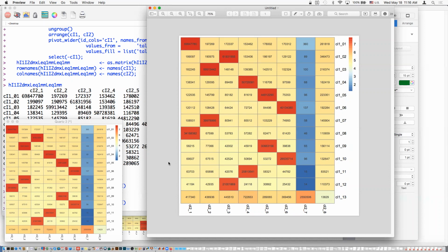Here it's not quite a unique dual, because while the rows are unique, the columns have two guys. But that's still way better than a guy that, say, has 50% or 80%. So here, if I1 changes, if I2 changes, that's moving along in the row, right? If I make the I2 wrong, then this guy moves to one of these other squares, which are all rejected. If I1 changes, then he's moving around in columns.